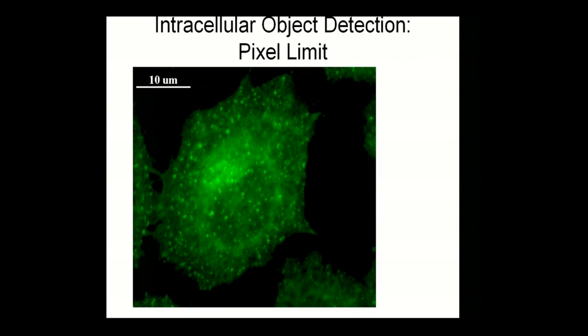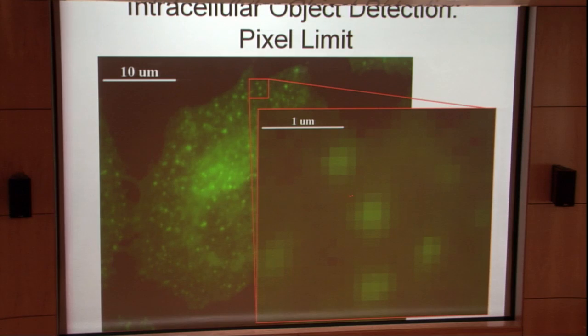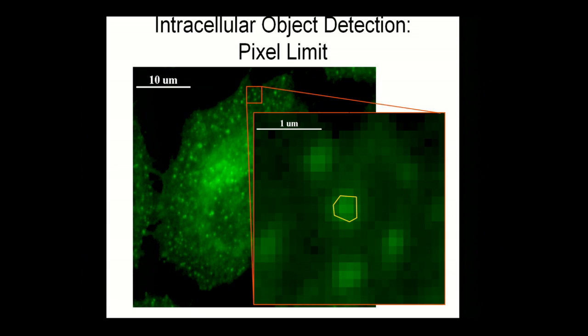you can take the image, but the problem is that the endosome we look for is very small. So this is the pixel size, and the pixel is about 100 nanometers. It's quite small, it's below the diffraction limit. But how many pixels belong to the endosome? Where do we put the border? Here, here, here. Depending on how we choose the border, we have very different answers. And all our results will be very discrete and pixelated at the level of the quantities we want to extract: size of endosome, amount of fluorescent cargo, etc. So how do we handle this?